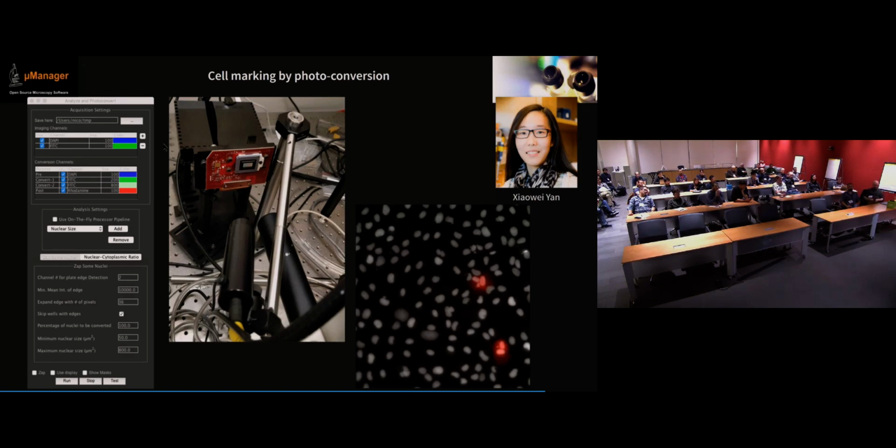I thought that nobody would be crazy enough to do something like this, but then there is a bioRxiv preprint from late last year from a group at Washington State, where they did something similar, and to my dismay, they had actually done this in MetaMorph using MetaMorph journals. So clearly it can be done. The only thing I can say is we had a lot more fun than they had.